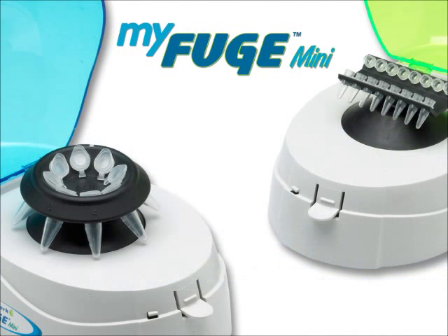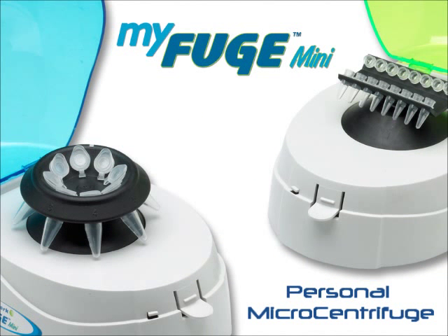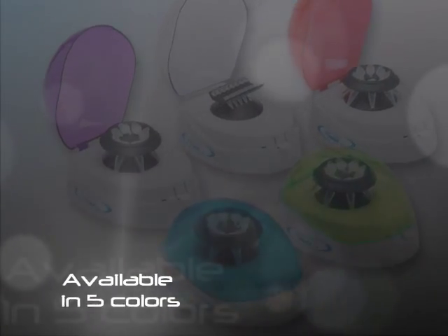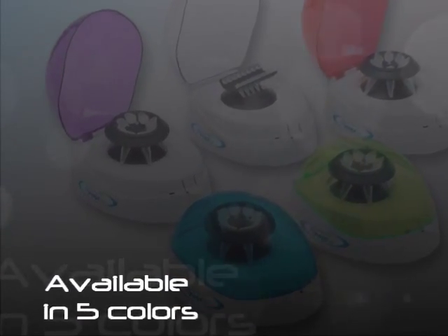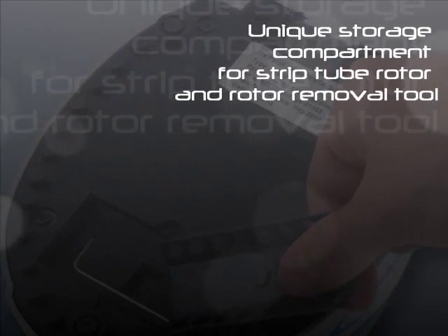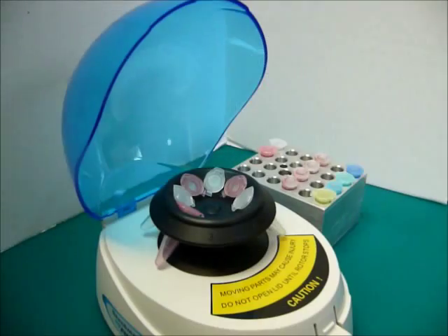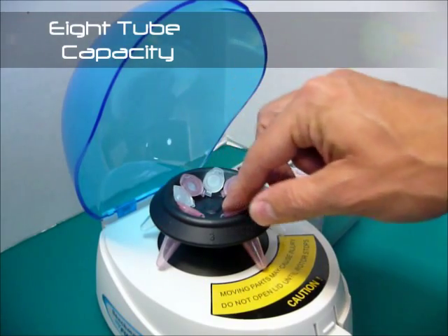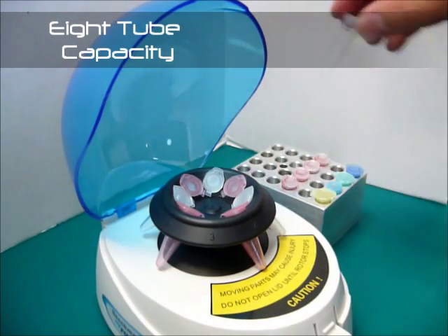The MiFuge Mini is a personal size mini microcentrifuge designed for the quick spin down of microcentrifuge tubes. The MiFuge Mini is the only mini centrifuge that includes a storage compartment for both the PCR strip rotor along with the rotor removal tool. Unlike traditional mini centrifuges, the MiFuge Mini features an 8-place micro tube rotor for increased productivity.